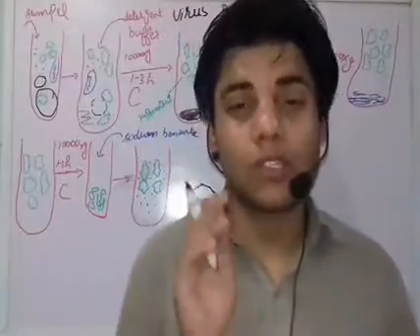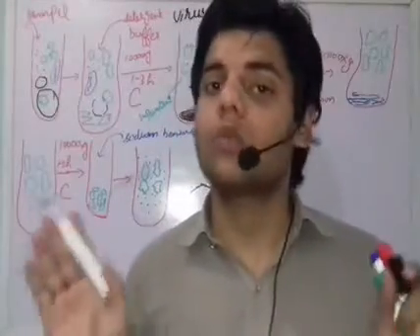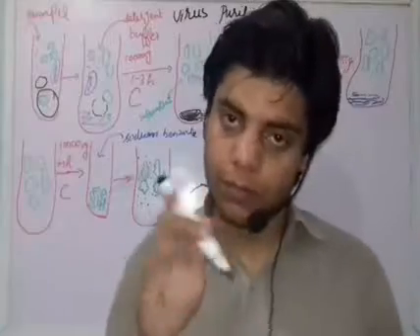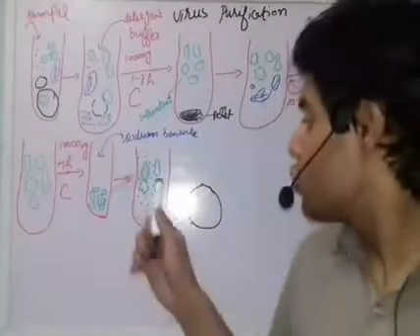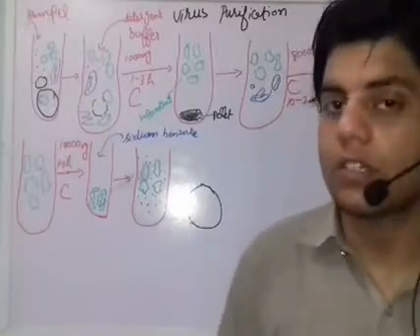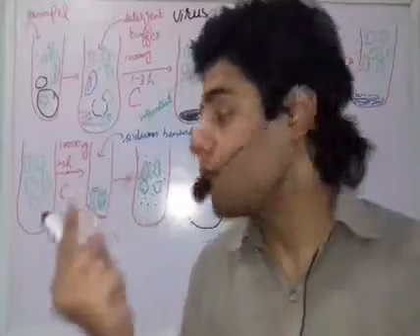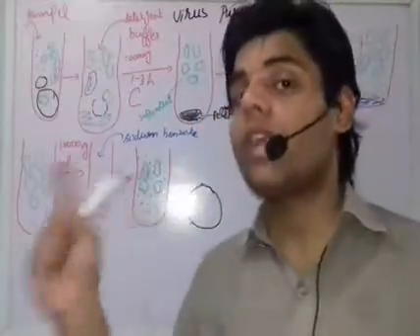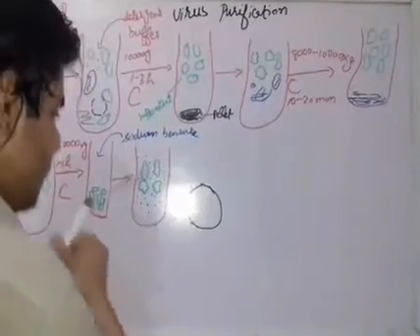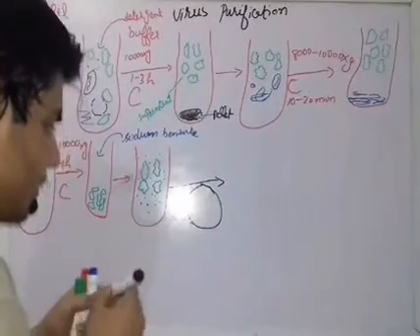Now how do we remove the sodium benzoate from this solution, so that finally the viruses will be in a purified form? How will we eliminate the sodium benzoate? Once we get the viruses with the sodium benzoate, we eliminate it with the help of centrifugation once again.